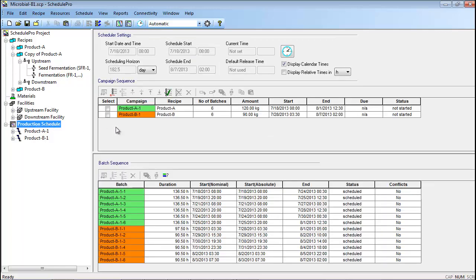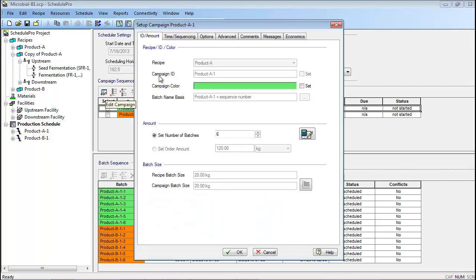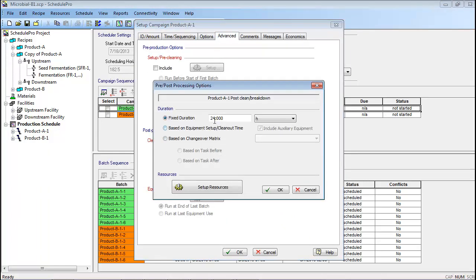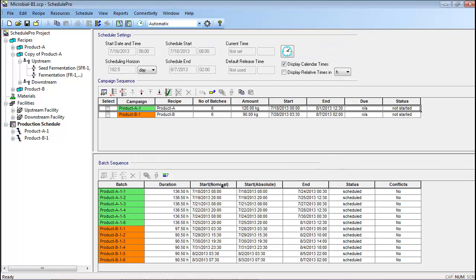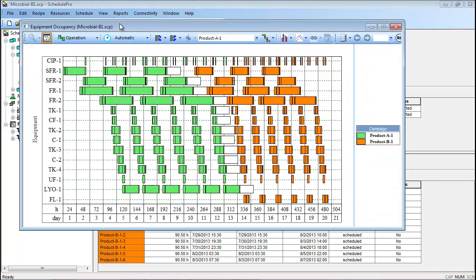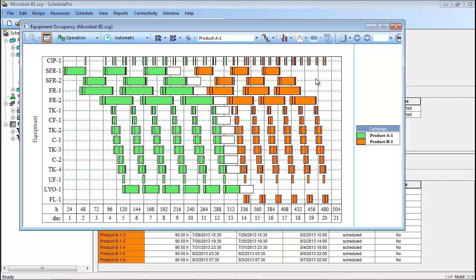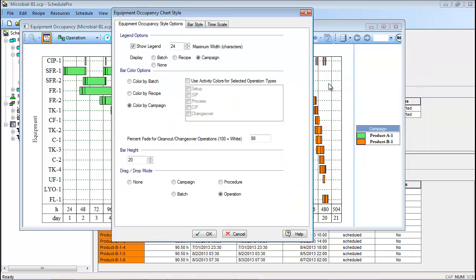Next, a production plan with six batches of Product A and six batches of Product B was created. Furthermore, a 24-hour changeover was scheduled at the end of the Product A campaign to account for cleaning and other activities between the campaigns of different products. The resulting EOC for the two recipes is shown here. Notice that all batches of the Product A campaign are green, and all batches of the Product B campaign are orange. This is a change from the previous EOC, which showed each individual batch with a different color. Modifications to the EOC color scheme can be made by right-clicking an open area of the chart and choosing Edit Style.